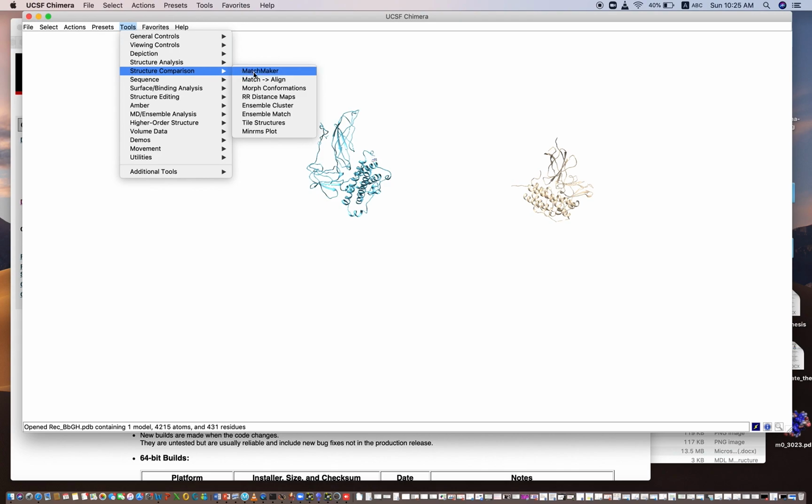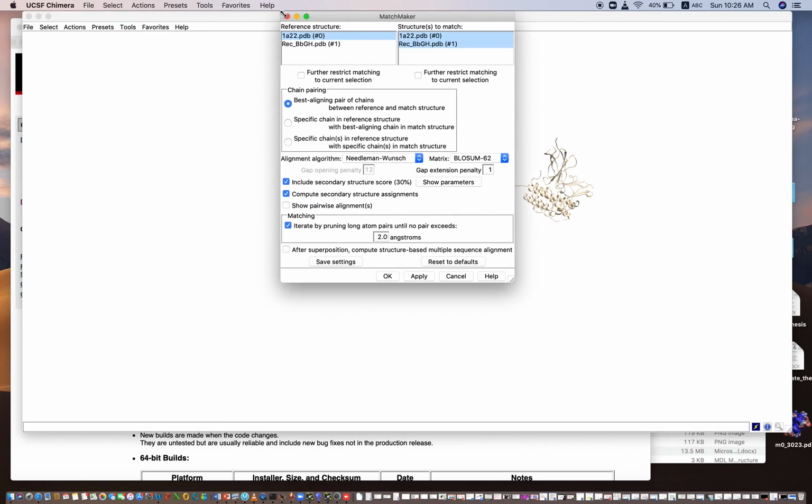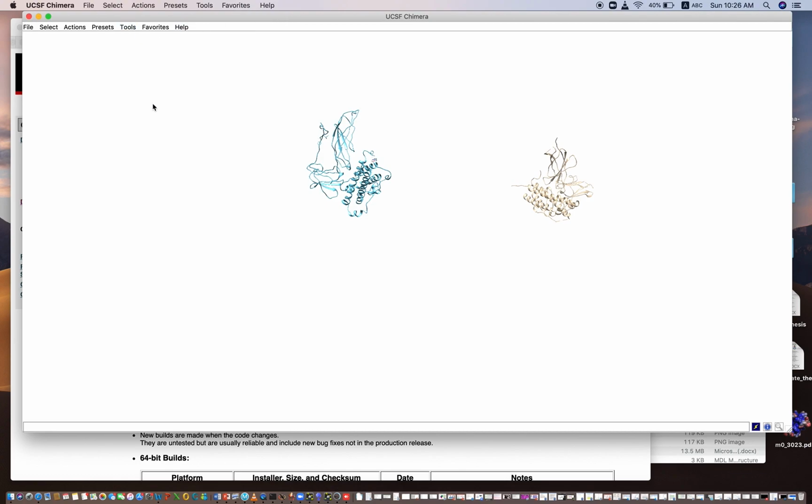So this was our project, back in 2012 or 14. We also uploaded the sequences in NCBI. Now we want to check whether our docking is good or not.